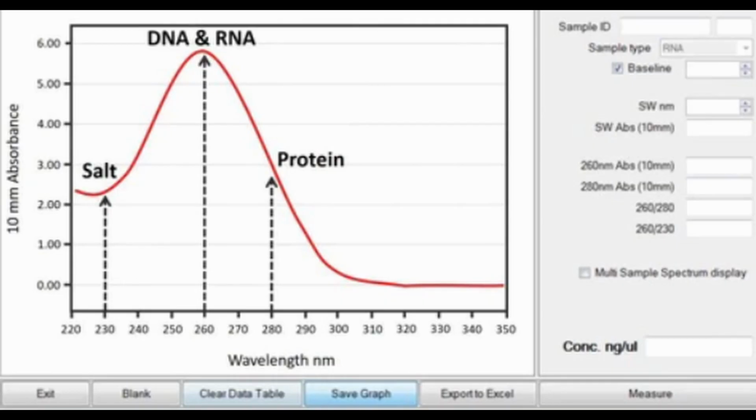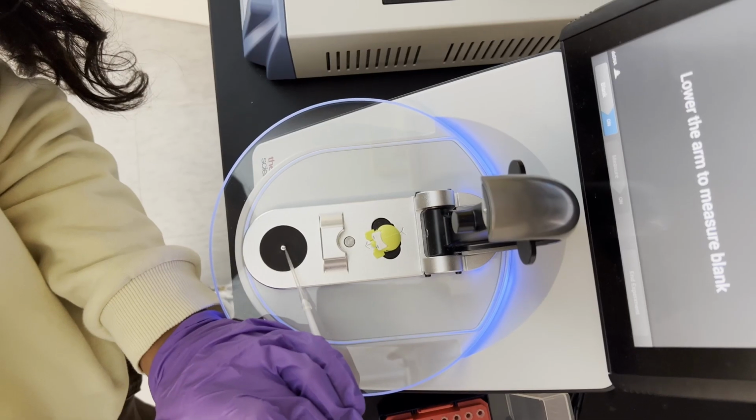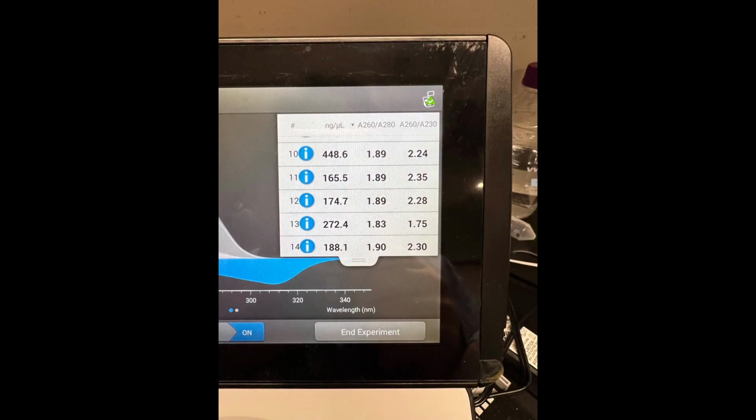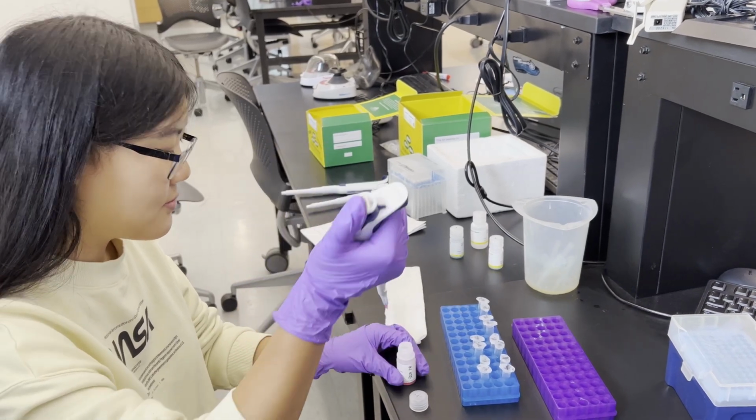Finally, we can check our mini-prep results with a nanodrop. We're aiming for an A260/A280 of 1.8 to 1.9 and an A260/A230 of 2 or higher. Having followed our protocol really carefully, we get good values, ideally. And if not, you should work through this protocol to see what could be the cause of your low purity and try to optimize to improve your results.